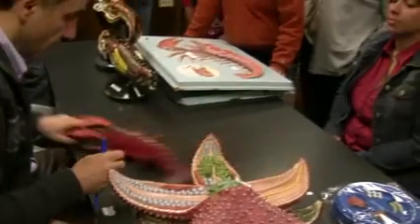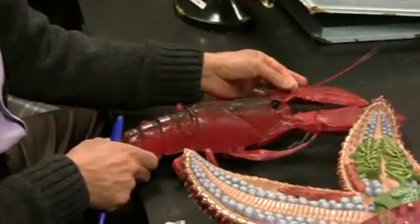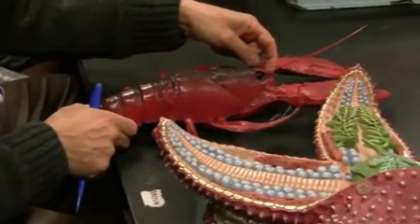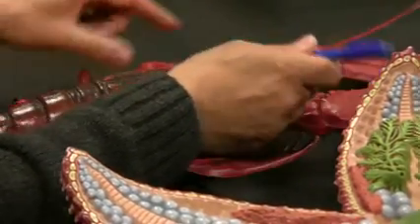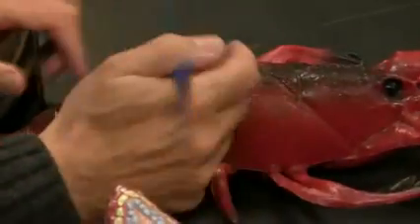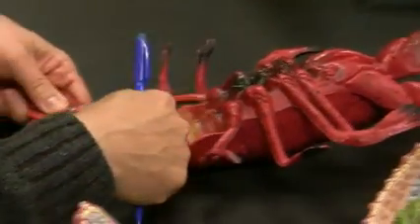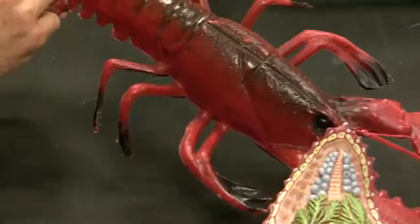Like Forrest Gump. Okay, this one. Antenna, antennule. I'll put a piece of tape here. What is the name of the structure? Antennule. Antenna, rostrum, right? It doesn't have a big one, but it's a rostrum. Okay. Compound eyes, cheliped, chela, walking legs, carapace. Okay, and these are tergum, right? Sternum, uropod, telson. This is all telson, okay?